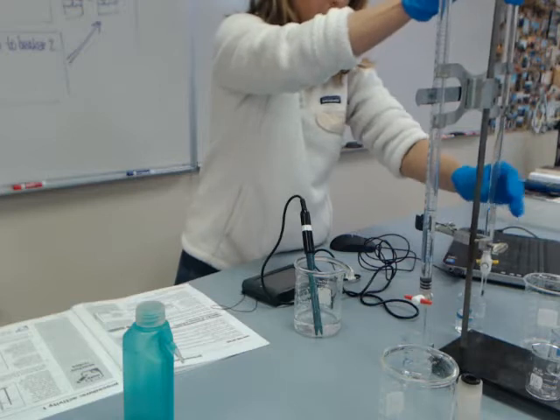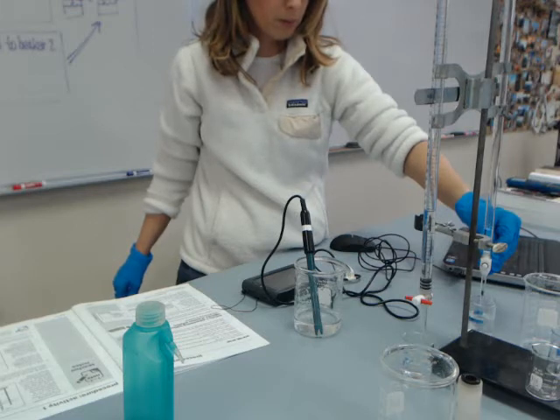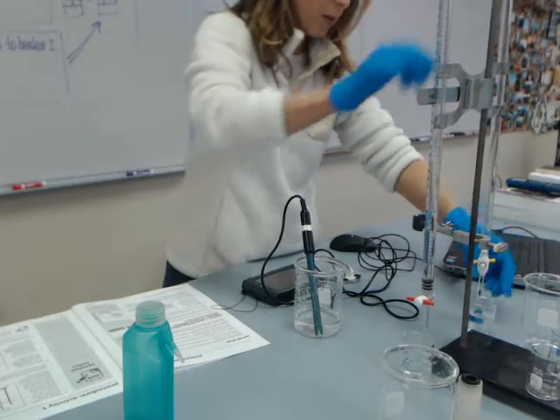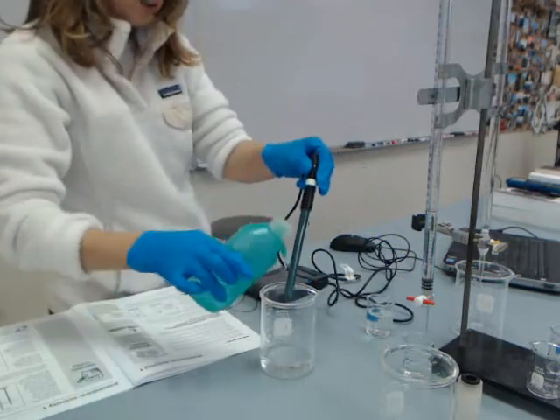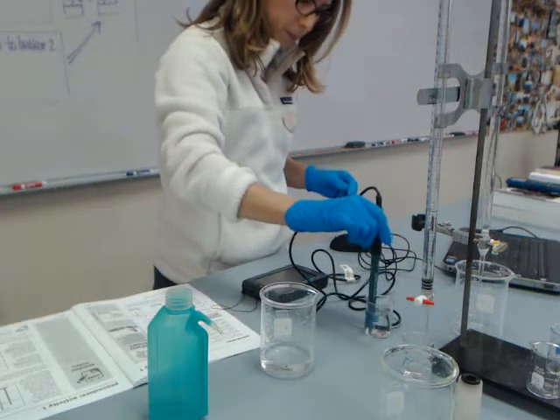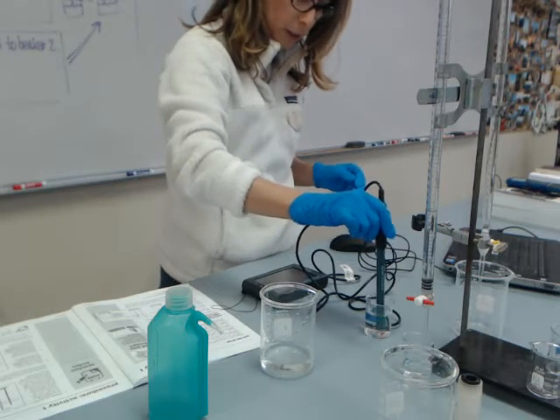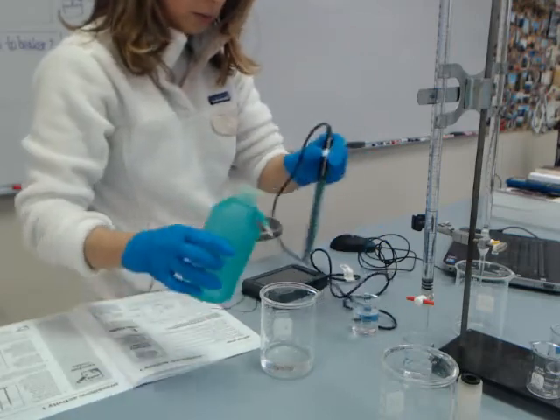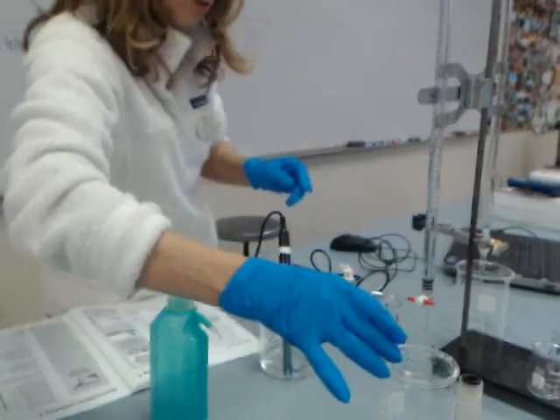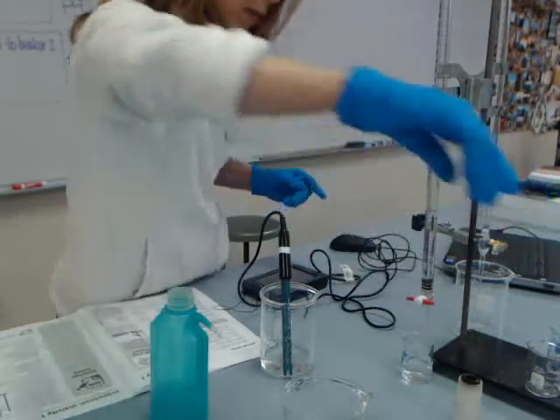Let's put it back underneath the burette — we want to add another five milliliter portion of the hydrochloric acid to it. Then the waste beaker back under it. Let's get the pH one more time — stir a little bit. The pH has dropped to about 3.66, 3.67. So we're done with that, and I'm going to go ahead and pour this into a waste beaker.